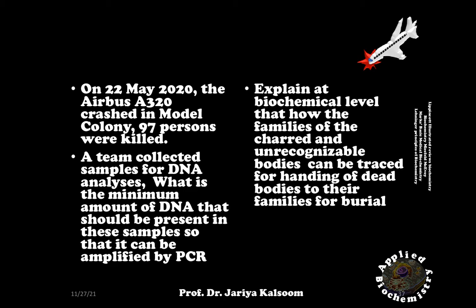The resultant pattern of marks is analyzed, but this is a cumbersome procedure, and this assay has been replaced by approaches based on PCR and microsatellites, which are short tandem repeats, 2 to 4 base pairs in length, compared to minisatellites that are 10 to 100 base pairs. PCR amplifies the desired fragment with a specific STR many times over, creating thousands of copies of the fragment, and the exact sequence of the nucleotides can be determined by DNA sequencing or NAT, which is nucleic acid testing.